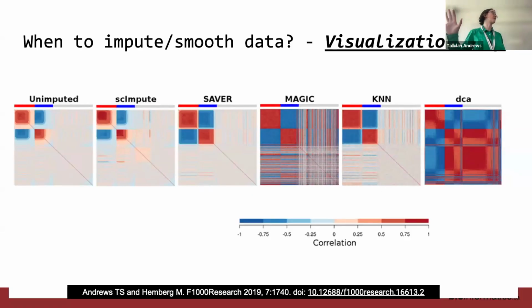You're only using it to visualize after you've done your statistics to show the patterns you see, and it does make the patterns much more obvious. But you should never draw conclusions based on imputed data, because it's very likely those will be false. But if you want to do it to show off how amazing the trend is we saw, you can sometimes fool people.